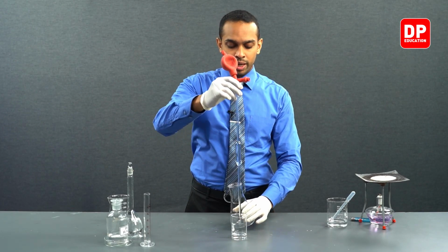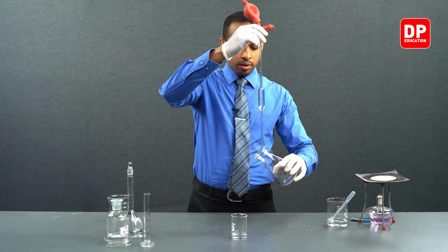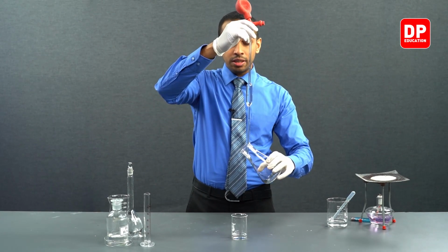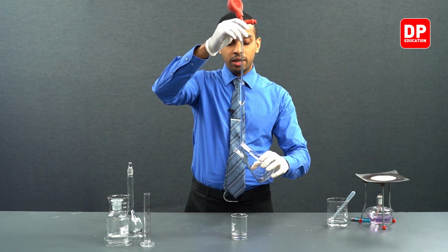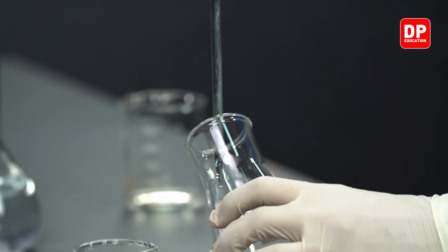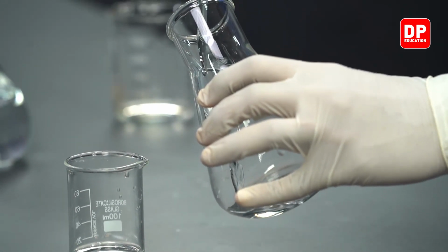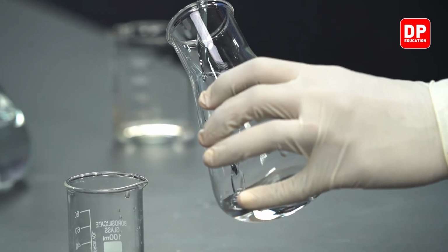Now we can safely take this pipette and make sure the tip of the pipette is touching the interior wall of our titration flask, and then we can allow the liquid to run down into the titration flask.